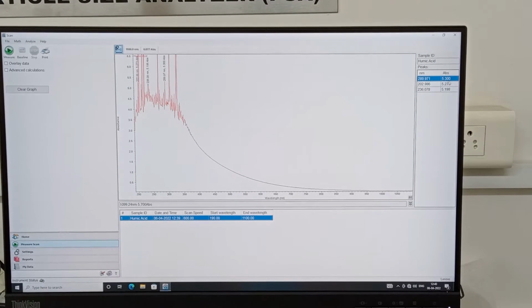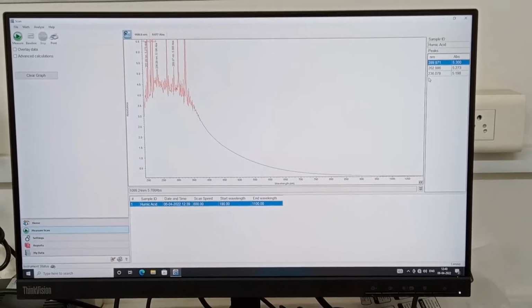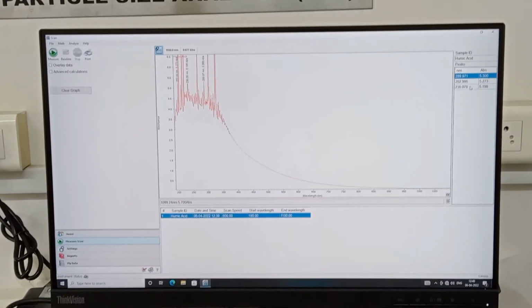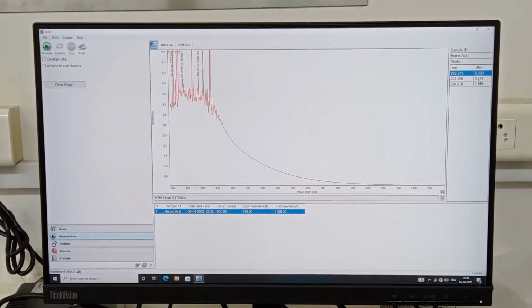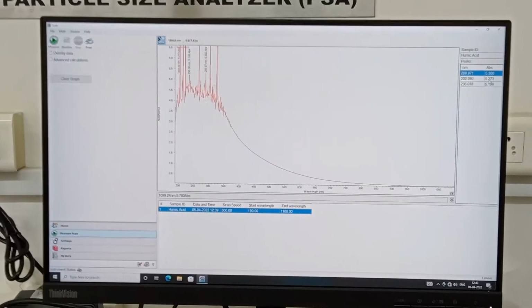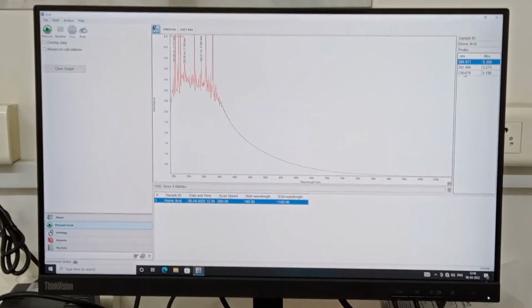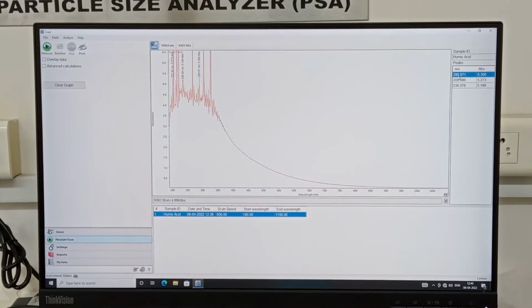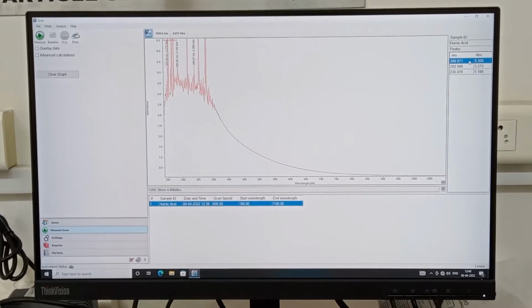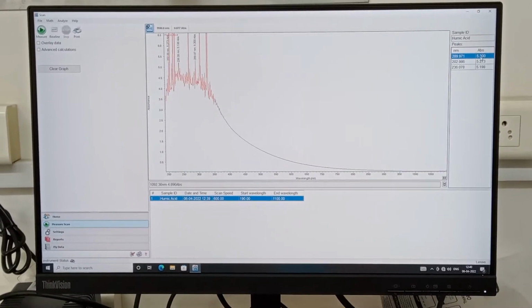Now you have to look up the literature to see which chemical structure those peaks correspond to, and based on that you freeze that particular wavelength, and for that wavelength you run the calibration using quant mode. Right now humic acid is close to around 289 nanometers. So I am fixing this in my quant mode because it is showing the maximum absorbance at around 5.3.